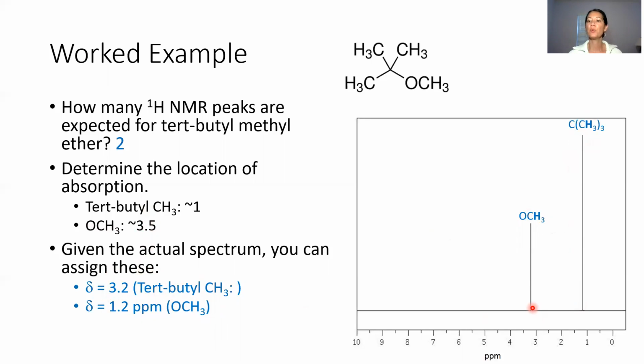Okay, you will also need to be doing the opposite. Given a spectrum that's not labeled, can you, given additional information and the molecular formula, come up with a structure perhaps? Okay, I'm going to end here, and we'll continue with the next two parts soon.